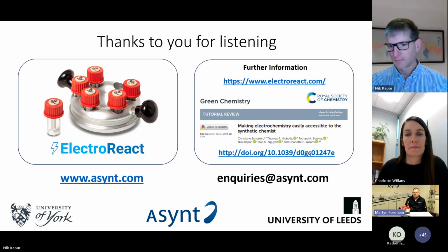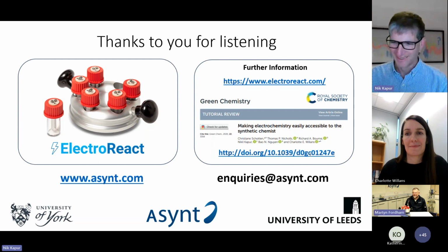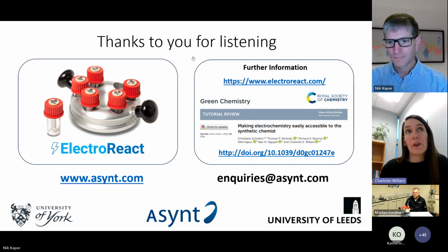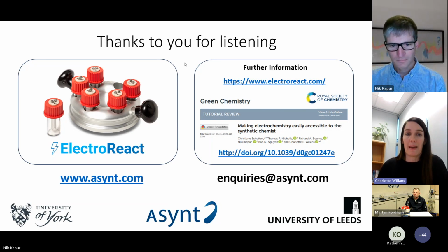Another question is, oh, sorry, I was just going to say I spotted another one there as well, but you go for it, Catherine. Thank you. Can immobilized catalysts be used too, or does the catalyst need to be in a homogeneous system? If you have your catalyst immobilized on a material that fits within those ports, then yes, an immobilized catalyst can be used. But your support would need to fit within that slot that the electrode goes into.